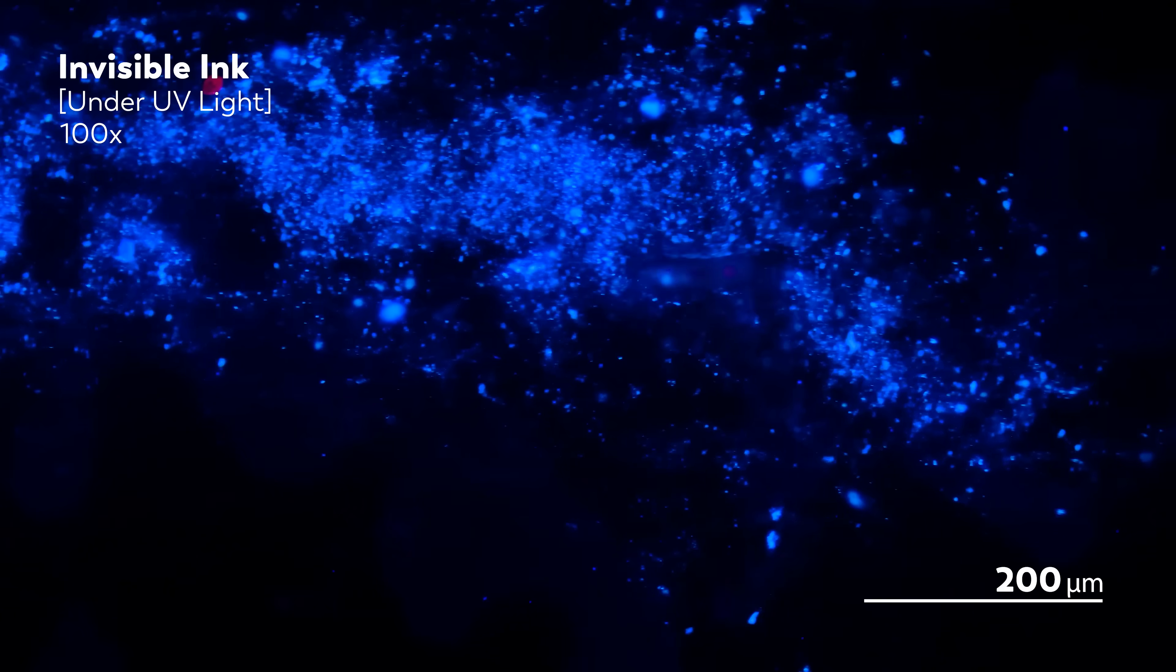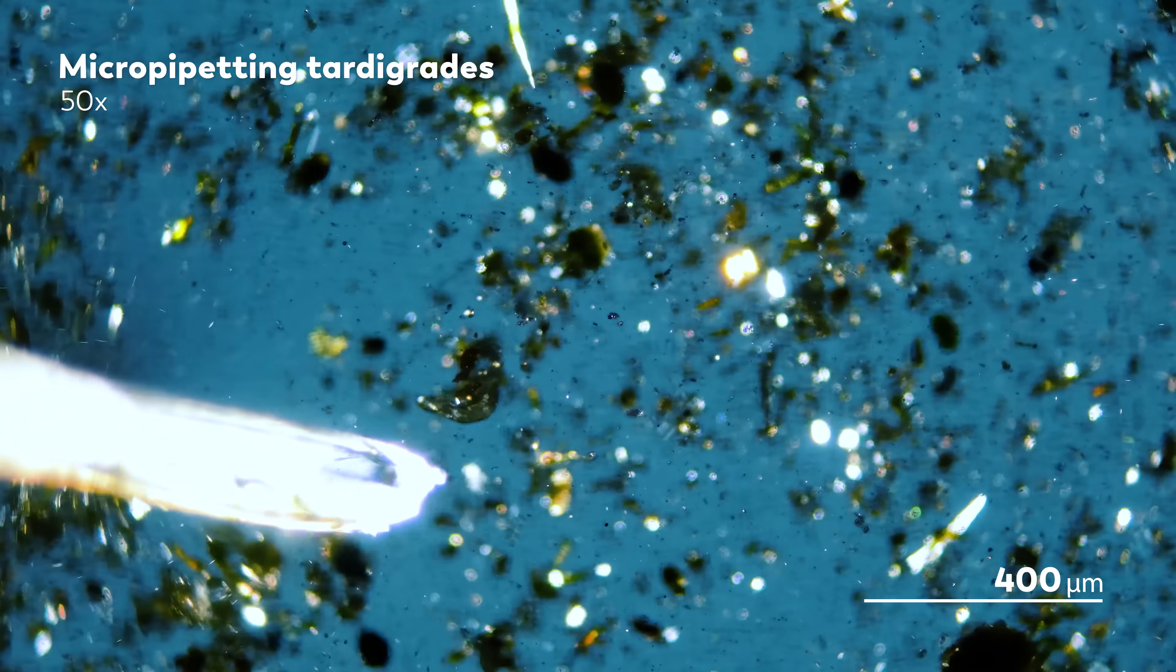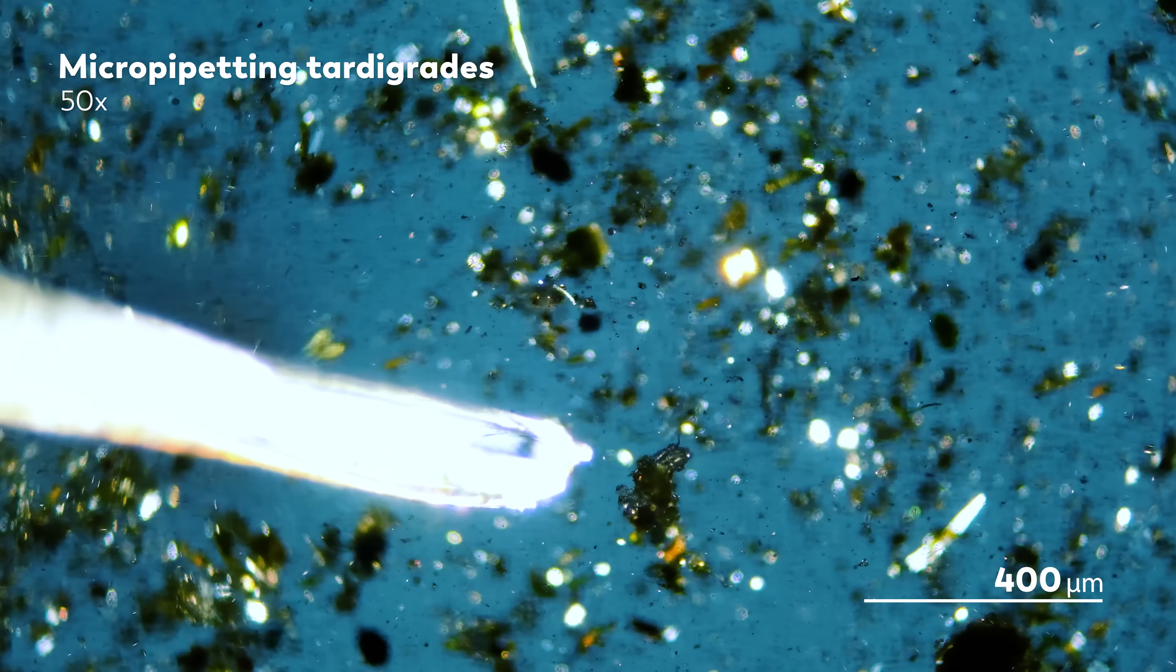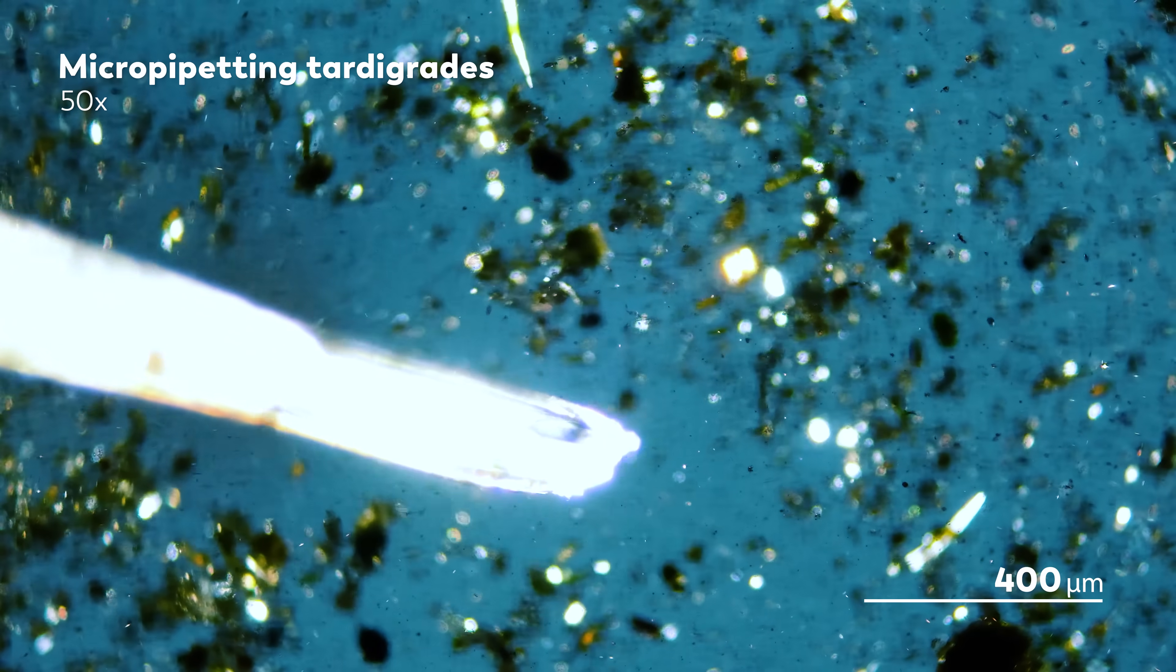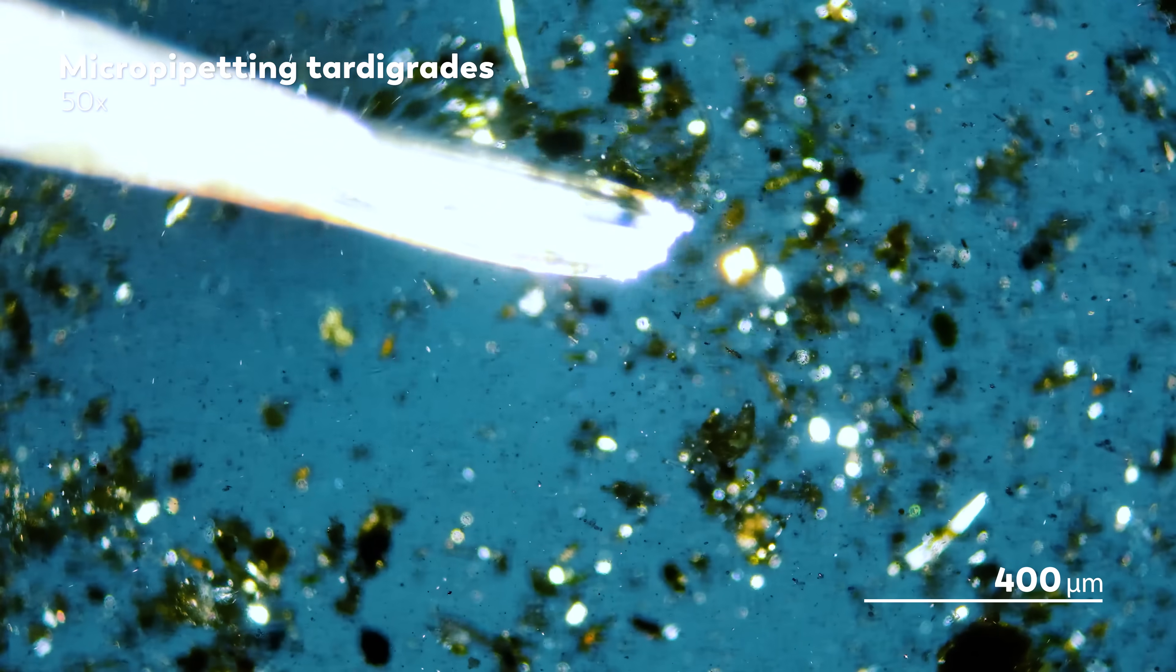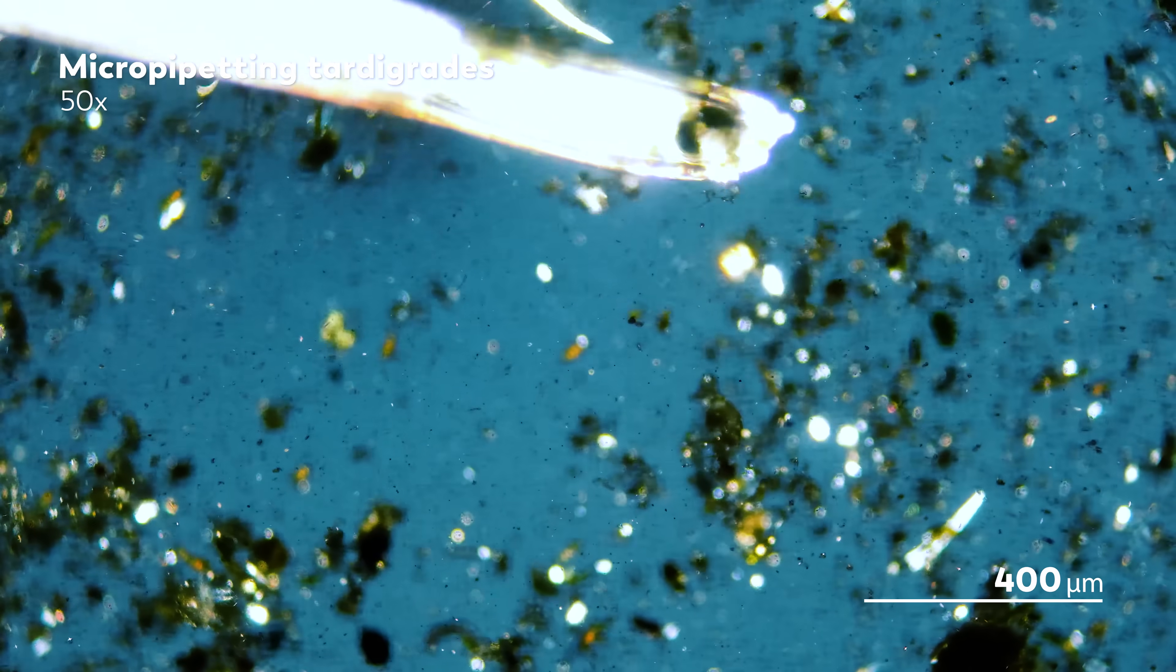But sometimes, his experiments are much more practical. For example, when he started microscopy, all of the books and papers that he came across described a very important skill for microscopy called micropipetting. This technique helps you grab just a tiny bit of a sample from your slide, the way that James is grabbing a single tardigrade here.